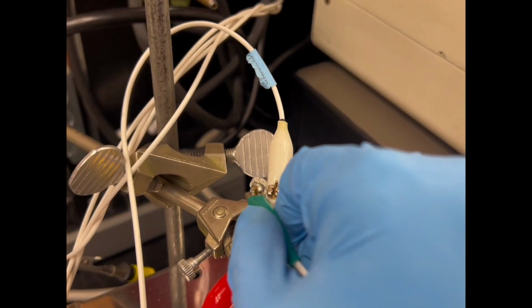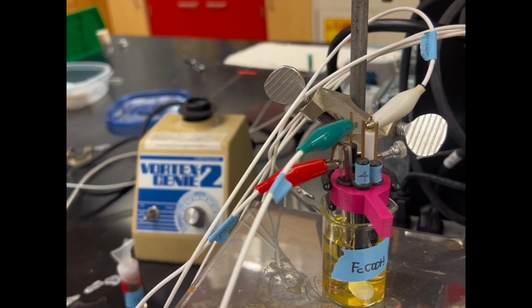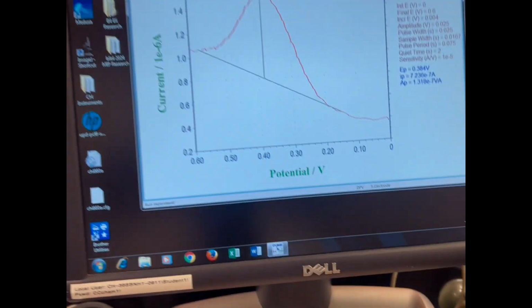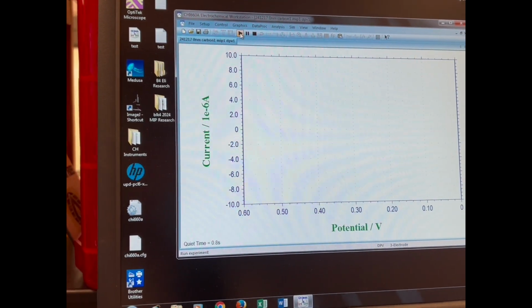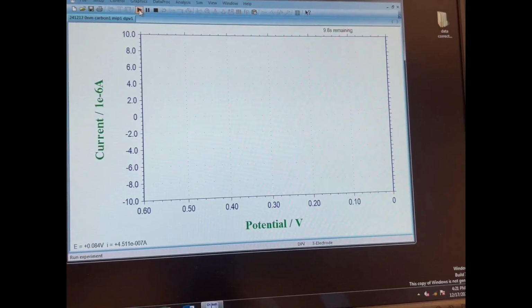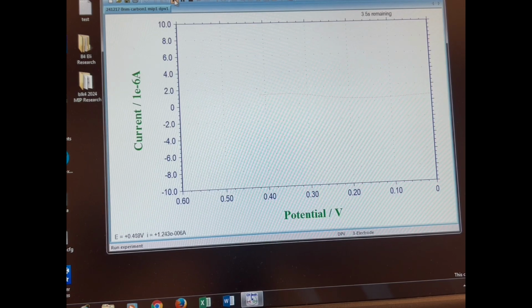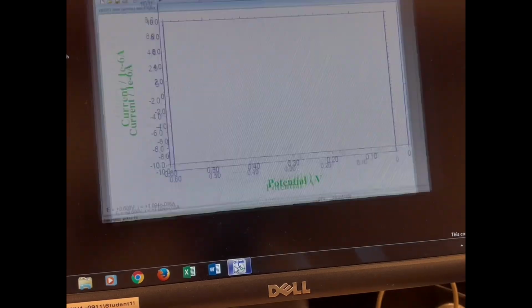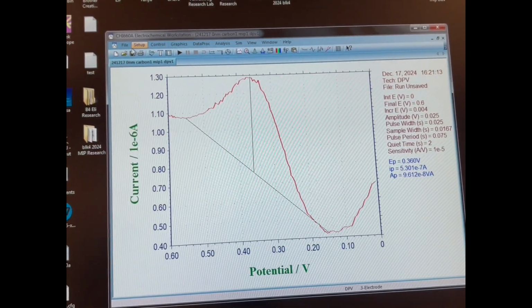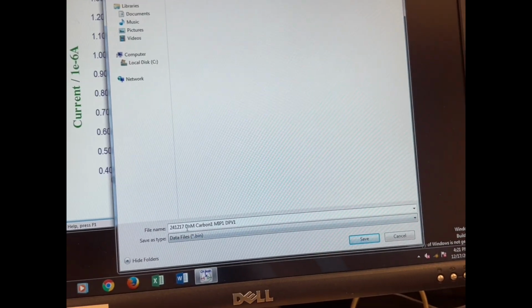And then we'll switch the connection to the second electrode and make sure everything is well in the beaker. We will also make sure the previous document is saved, and then we click the triangle to let it run. We could click the bottom to see how it looks, and then save it, name it, and then switch to the next electrode.